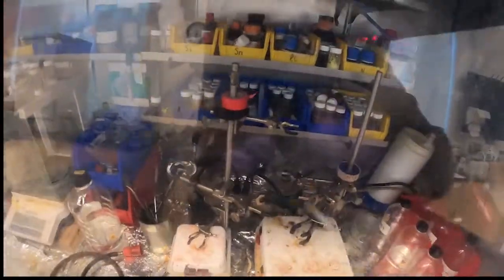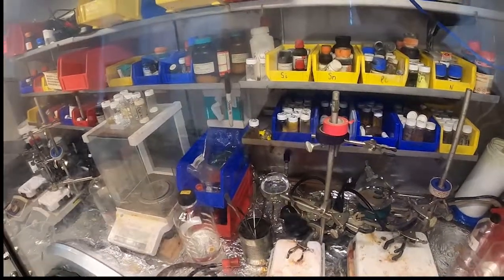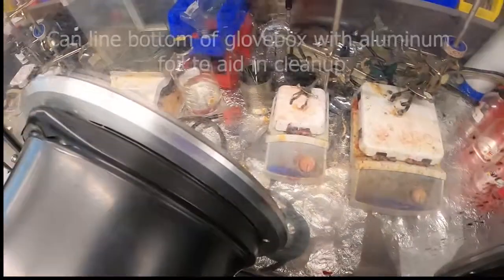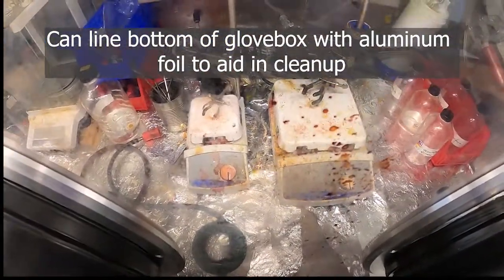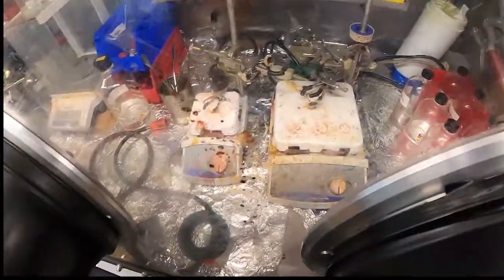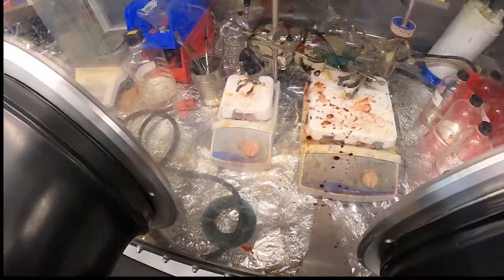Putting some lights on in there, you can see we have a lot of different chemicals stored in here. The bottom of our glove box is lined with aluminum foil — this makes cleanup easy if glass gets broken or a chemical gets spilled. We replace it every now and then when it gets a bit too dirty; it's just a convenient way of doing that.